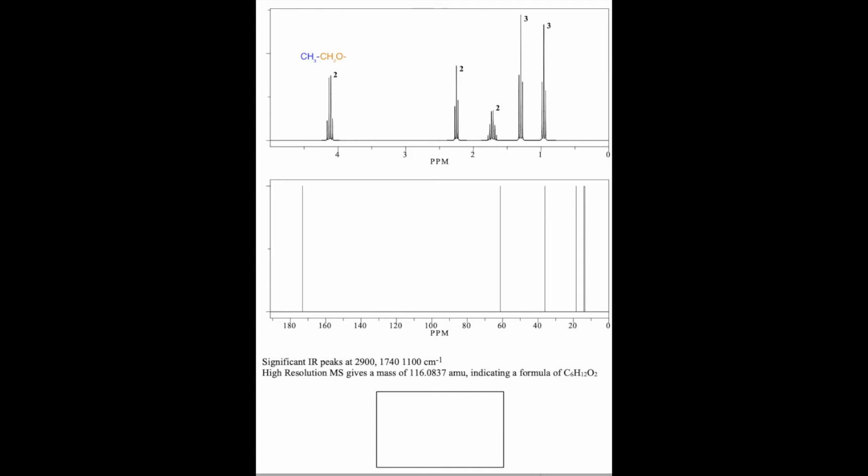Because that CH2 resonance is a quartet, right? And so with 3 neighboring hydrogens, n plus 1 is 4, making it a quartet. So look at all the connectivity, look at all the information we got out of just that one peak. And we only got that far with that one peak because we knew some other things from, in particular, the mass spec data, right? The formula. So I don't have any more interesting peaks with respect to chemical shift. All the remaining hydrogens are just generic hydrogens.